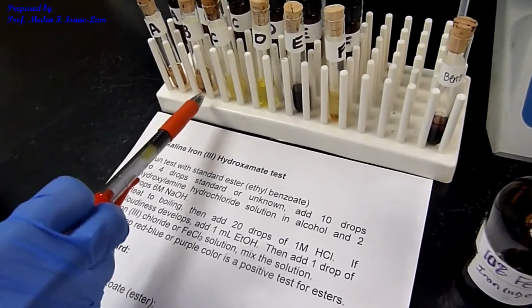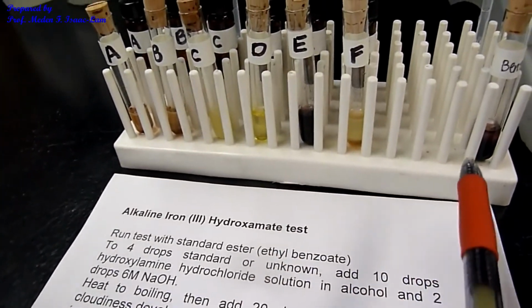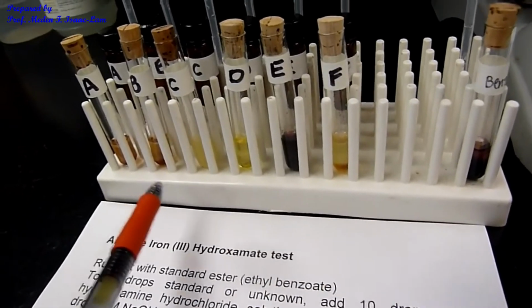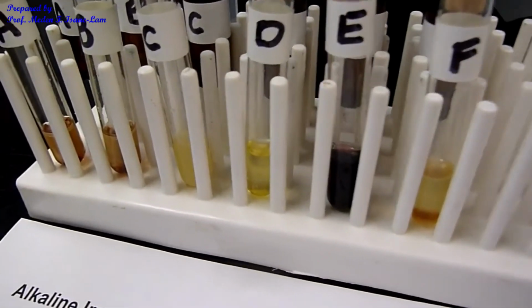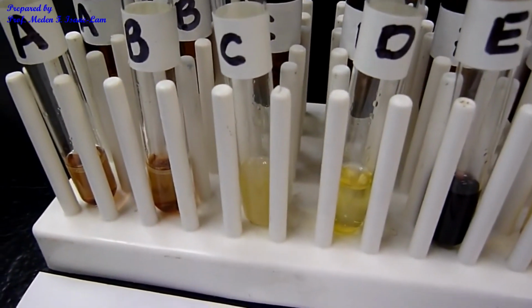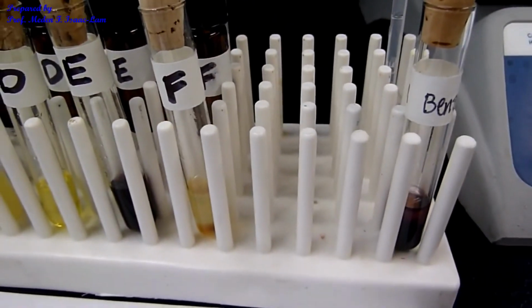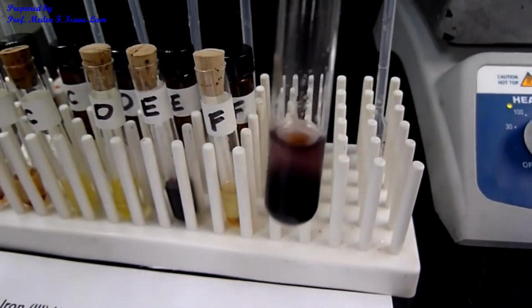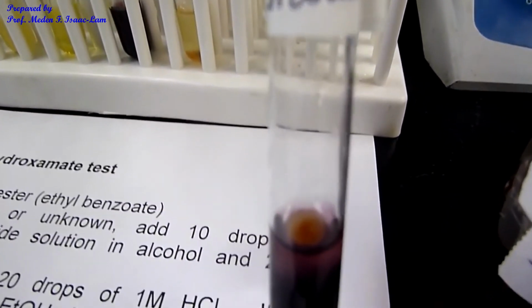So A, B, C, D, E, F. So this is the standard ethyl benzoate, and then only E changed color to a red, blue, or purple color. Ethyl benzoate is our standard.